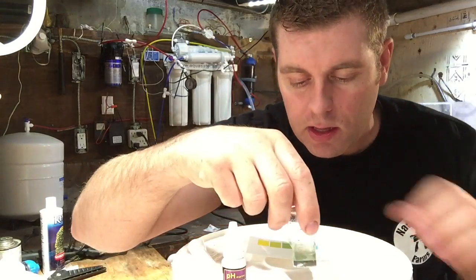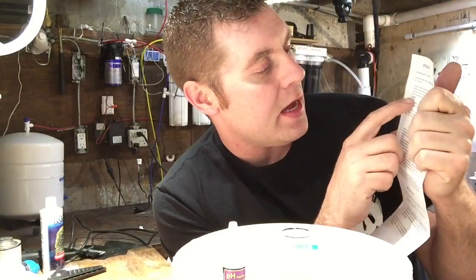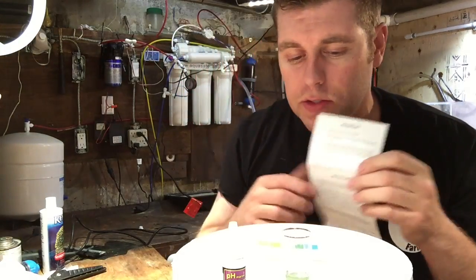And it says to shake — if you read your instructions, it comes with little instructions. It says add the 6 drops with your pH marine solution, and then it says you're going to swirl gently for 10 seconds. So let's do that — swirling for 10 seconds.